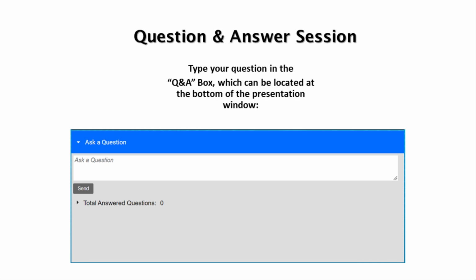Okay, good to know. Now let's talk about a little bit of what you've researched. Have you looked at all at mixed acids? Something that was brought up as an example, 0.1% FA with 0.01% DFA as a compromise? Oh, that's a really great question.